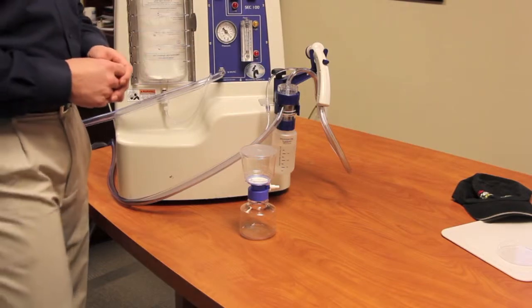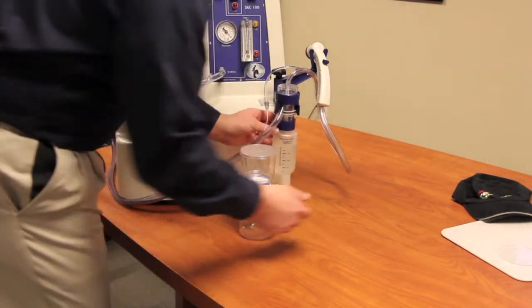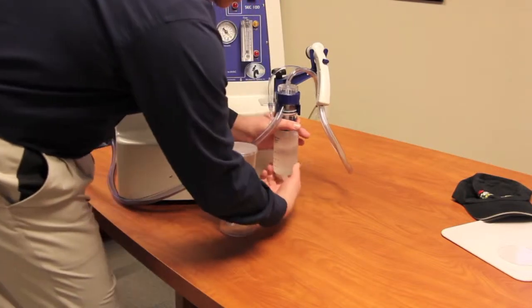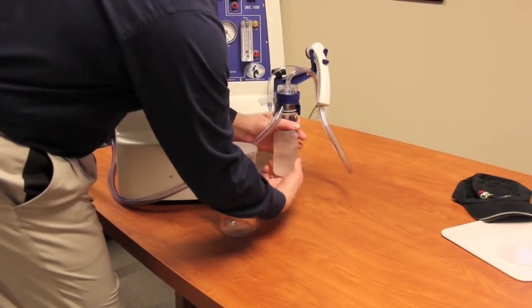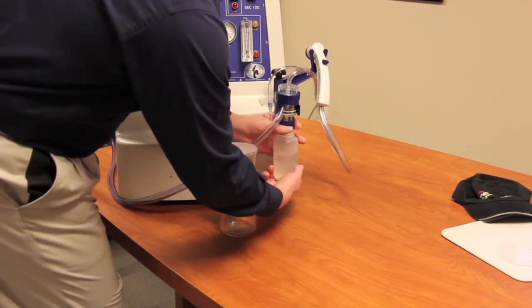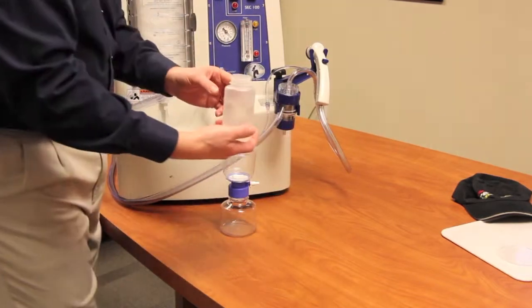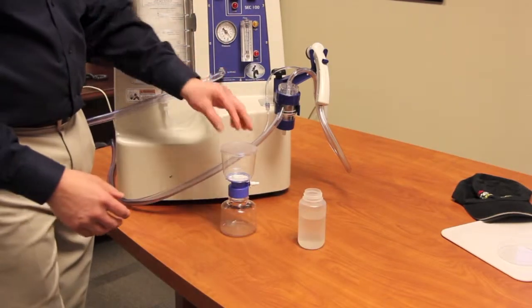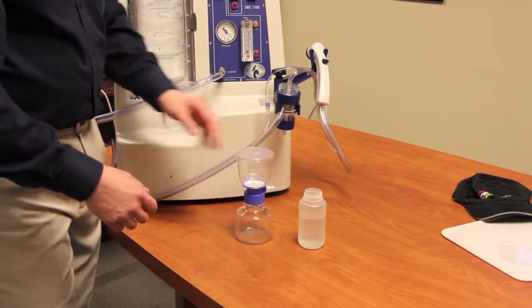So the first thing you want to do is take this sample bottle off, and you do that by grabbing this ring and simply twisting clockwise. Twist the bottle clockwise until it falls off, and make sure that once it lets go that you don't spill that sample. So now you have the sample there, and then you have your filter apparatus next to it.